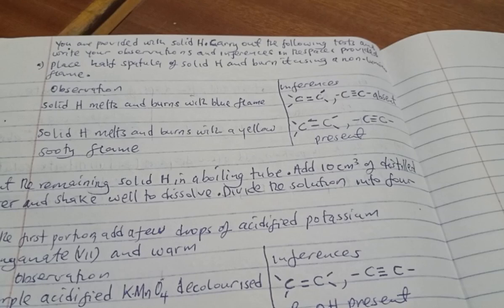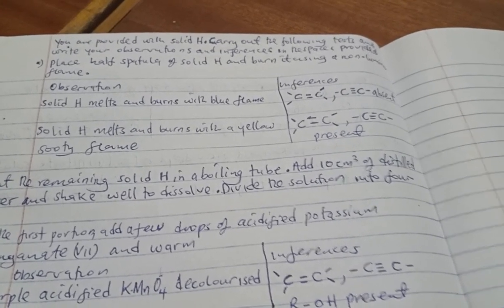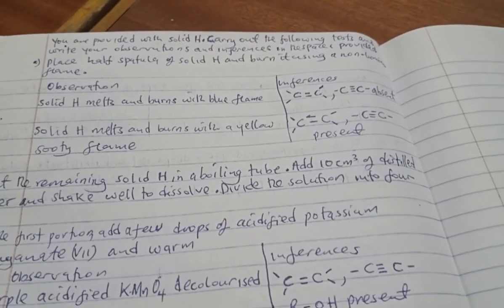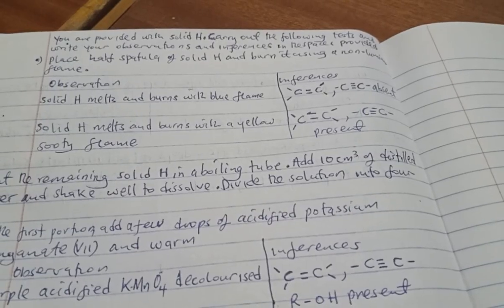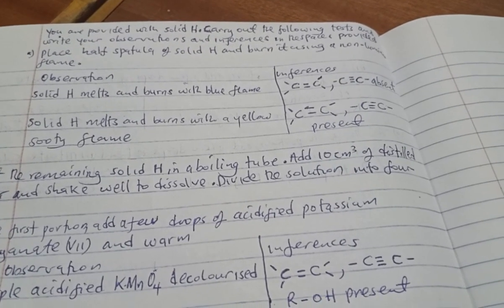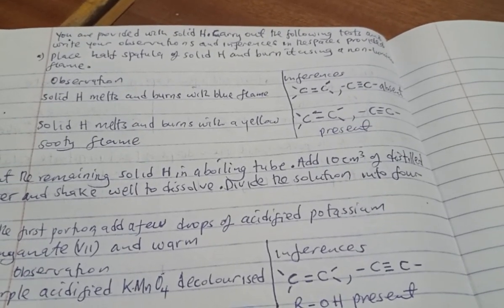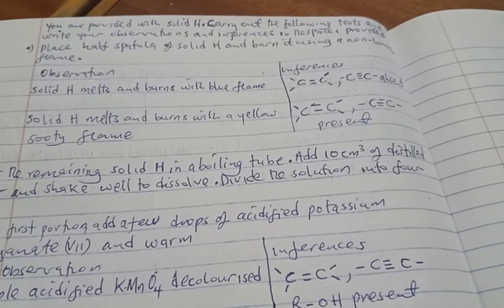So in this observation, we are testing saturation or unsaturation. For solid H, if it melts and burns with a blue non-sooty flame, that is the best observation.